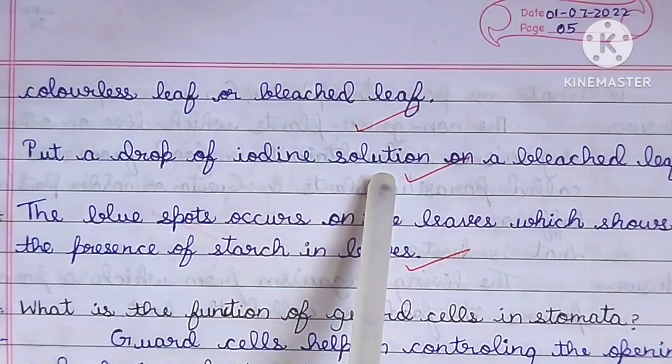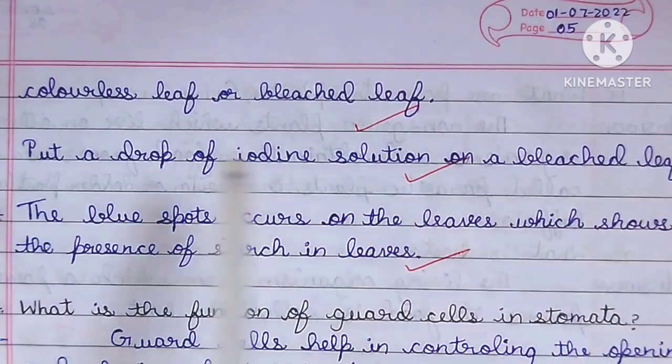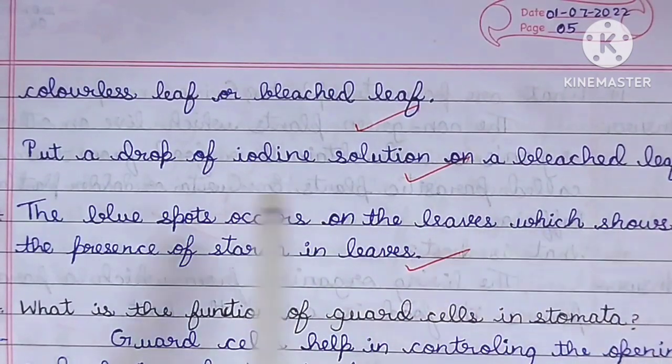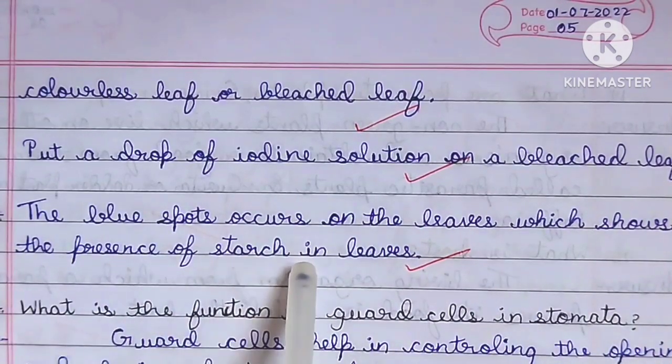Put a drop of iodine solution on the bleached leaf. A blue spot occurs on the leaf, which shows the presence of starch in leaves.